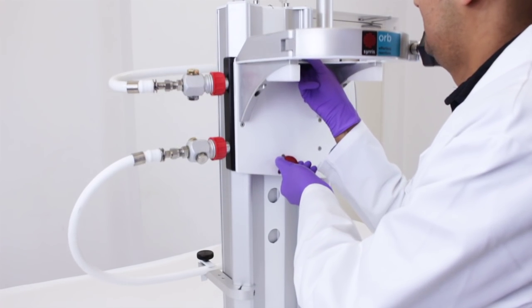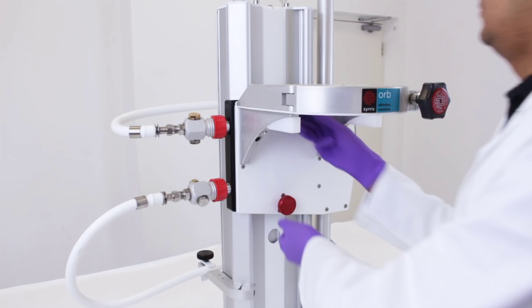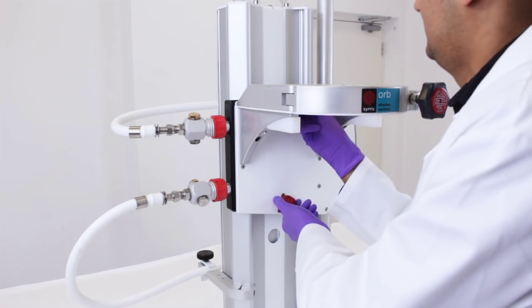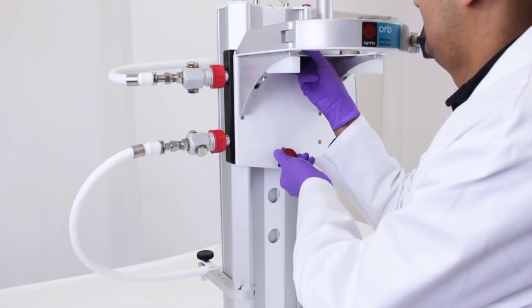For further convenience, vessel height can be quickly adjusted with no tools required. Simply pull back the panel knob and lift the panel to adjust the vessel height.